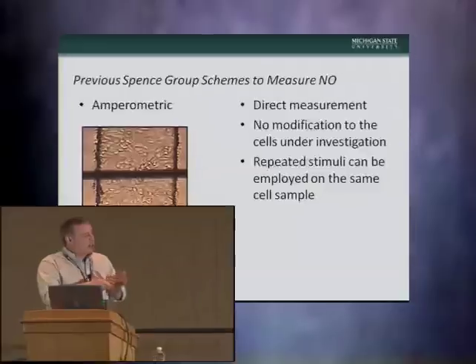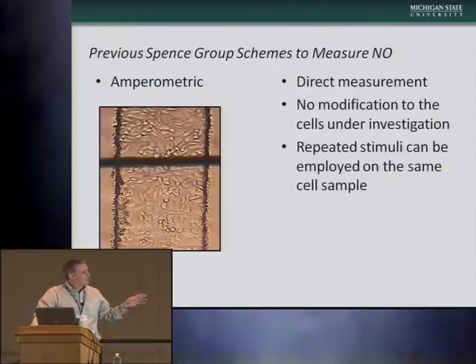Our group would then take another piece of PDMS, in which we had layered a confluent layer of endothelial cells in this particular channel, maybe 100 micrometers wide by 100 micrometers deep, and we'd lay that channel over that carbon ink electrode, stimulate these cells somewhere downstream, maybe with ATP, maybe with some sort of calcium ionophore, to get a nitric oxide release from these endothelial cells, and when pushed, maybe by some sort of syringe pump, over these electrodes, we could actually measure nitric oxide spikes coming from the endothelial cells. And this was actually published in the Analyst, I think, back in 2004.